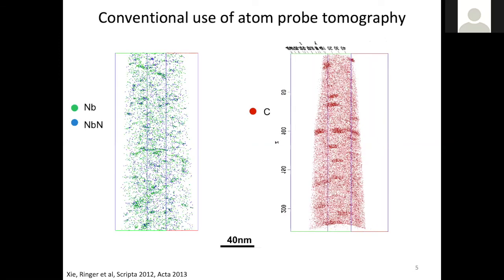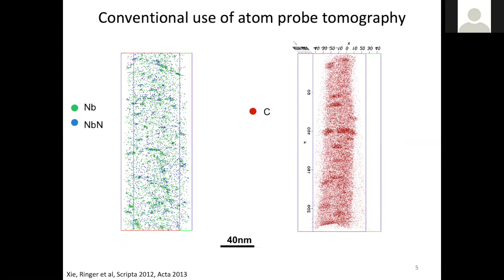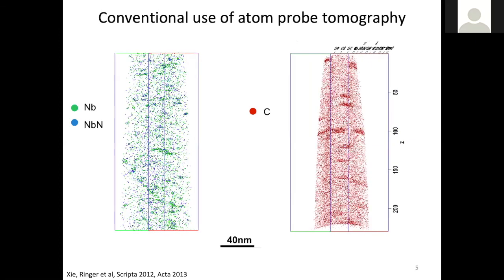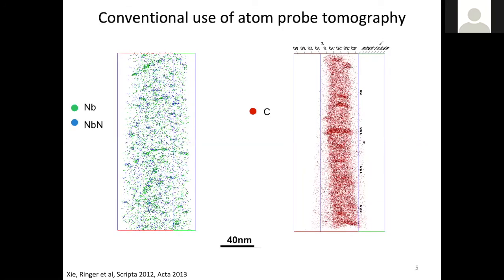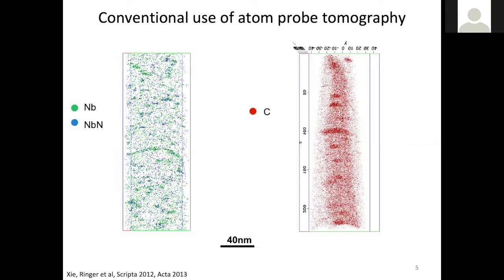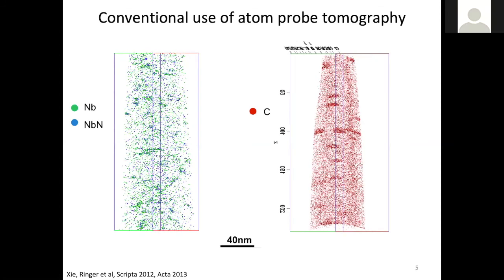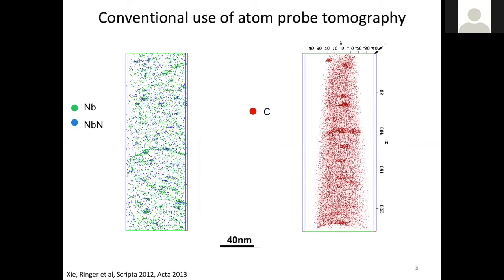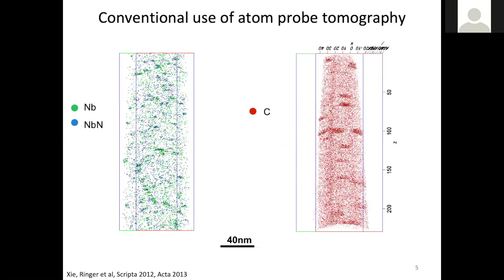What I want to say here is that what we are learning is fundamental physics. By applying fundamental physics like field emission, that simple concept, you can expand it into field emission guns in SEM, in TEM, as well as atom probe. So translating fundamental knowledge into the engineering world, you can do a lot of amazing things.